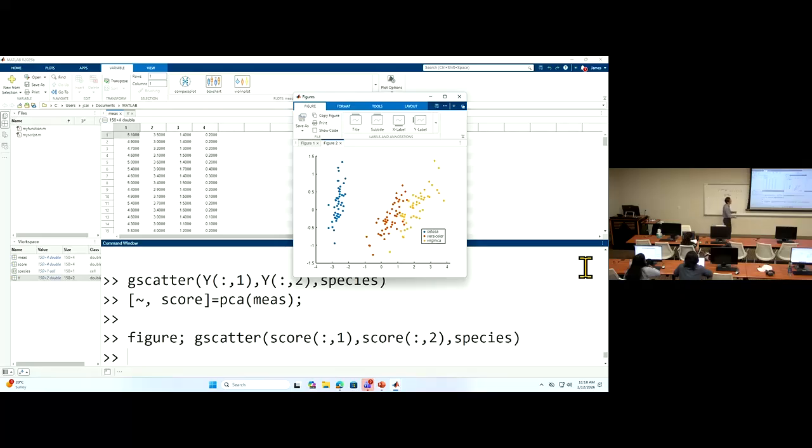You can also separate the blue fish from these two, orange and yellow fish, and they're separable definitely in their space. So PCA also does a good job here, okay? But not as clean as this tightly grouped t-SNE separation. If your purpose is to group cells by types, then t-SNE will have a better resolution.